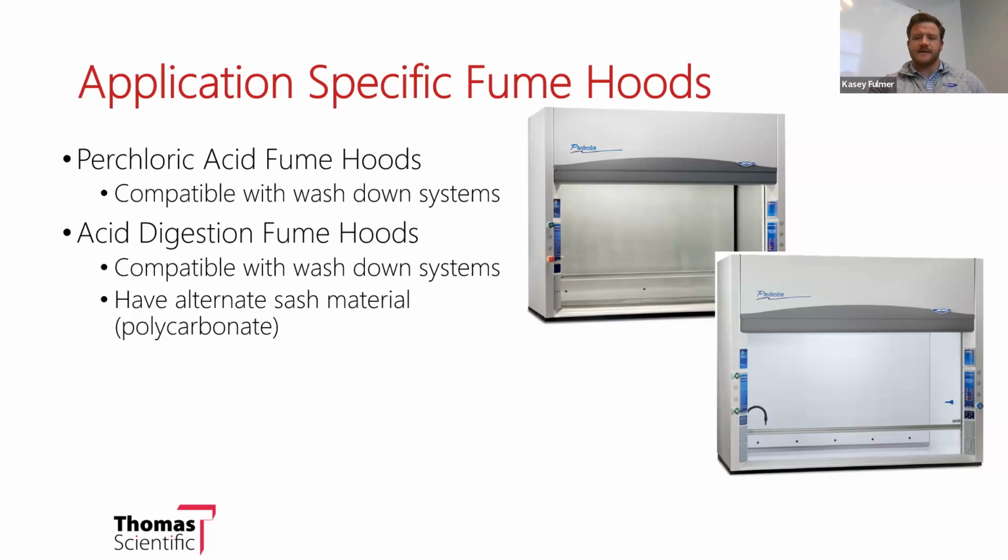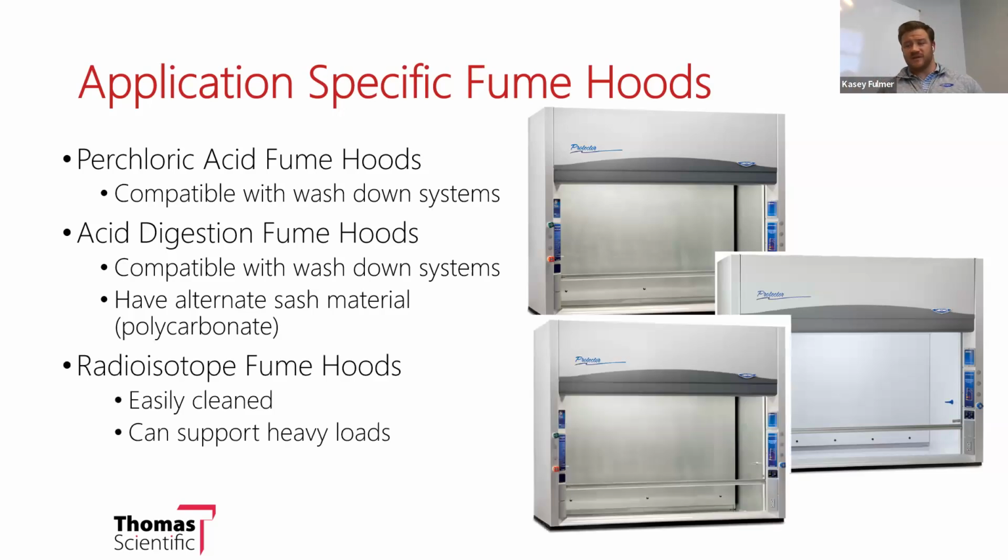that everything's accounted for. There are also radioisotope hoods that are made of stainless steel, so they're again easily cleaned, as I mentioned earlier. But also sometimes in radioisotope applications, they're using gamma radiation, and to protect the user from gamma radiation, it oftentimes requires this buildup of 2-inch thick lead bricks. If you know anything about lead, you know that it's very heavy. Well, the stainless steel integral work surface of those radioisotope hoods is conducive to holding that kind of weight.